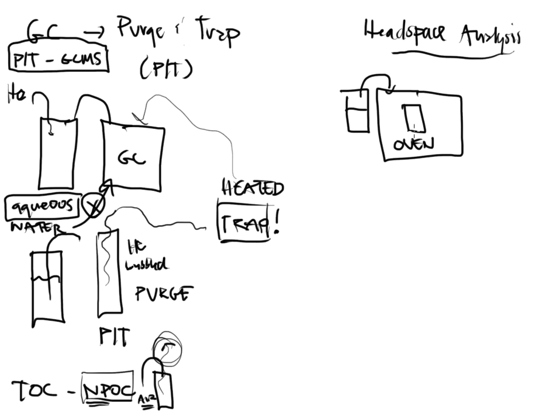That sample gets heated, and my volatiles really do turn into a gas form at this stage. Then on the inside of this oven, there is a needle that will eventually puncture the vial that my sample is in. It will suck out only the air, the vapor, the gas from that container, and send it into a GC system for analysis. That's the only difference.